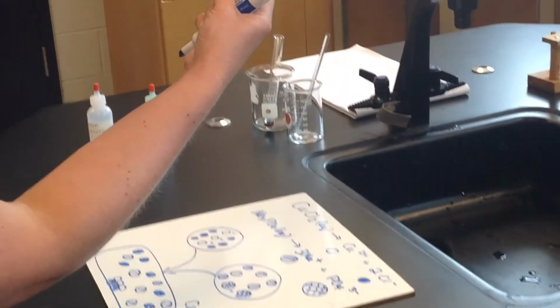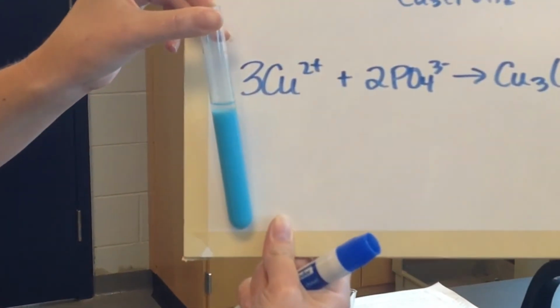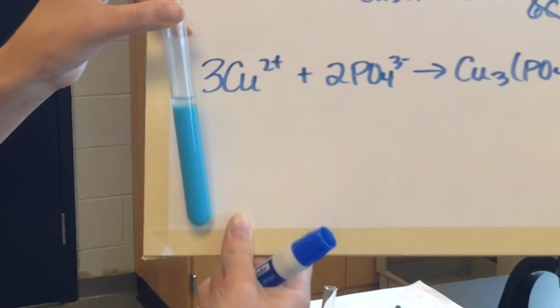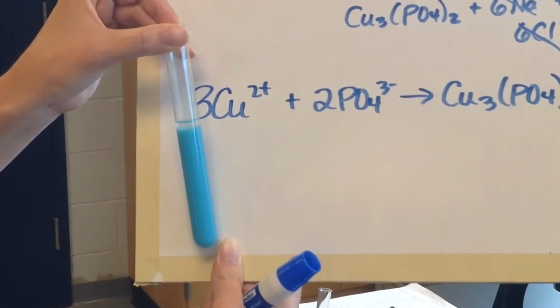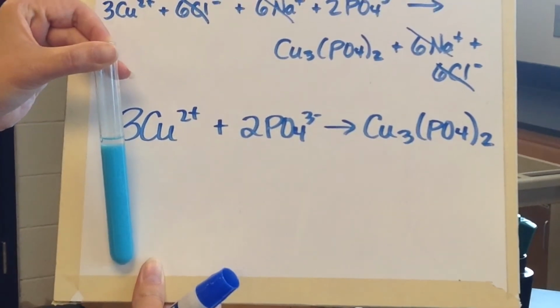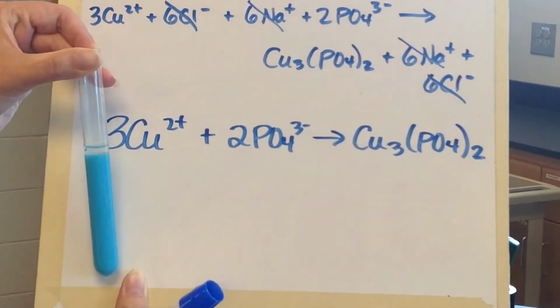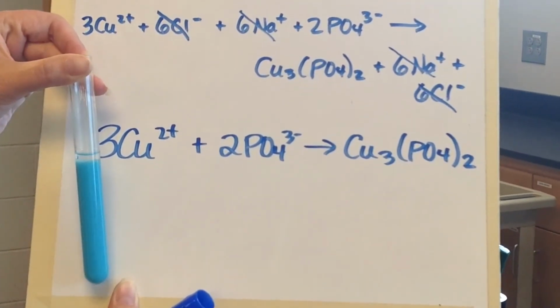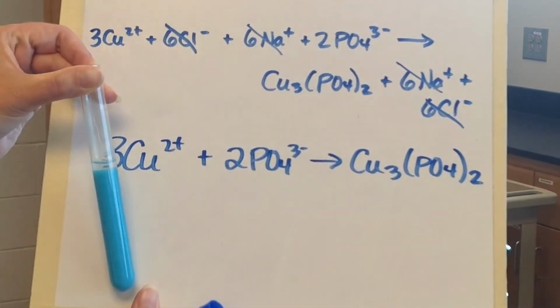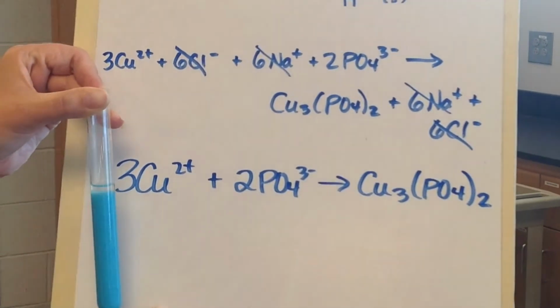You can definitely see that we've had some settling out, and really kind of neat. You can see that clear, colorless solution at the top, and you might say, well, what kind of solution is that? And if you look up here, it's a saltwater solution. And so what's present in the clear liquid there, clear solution, is dissolved salt and water. And then all this blue, which if we let it keep sitting will settle even more, is your copper phosphate solid. We could filter it out and do all that if we wanted to.